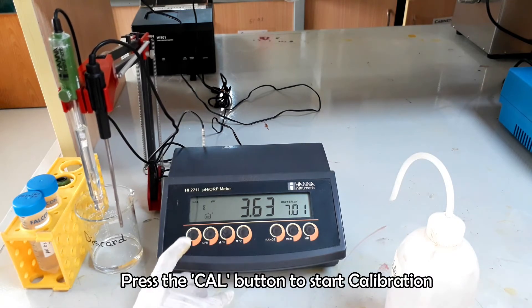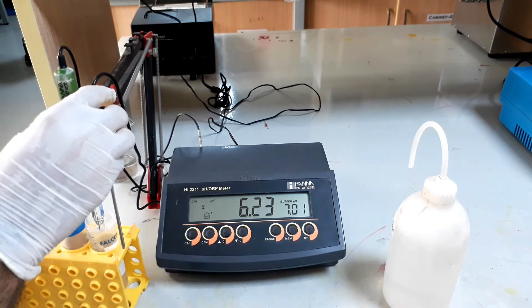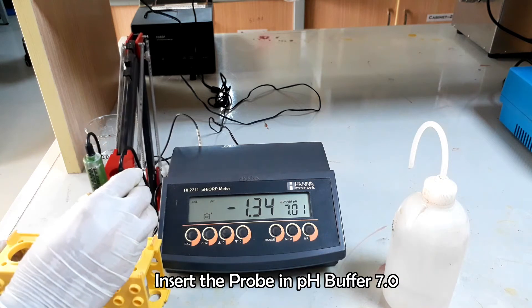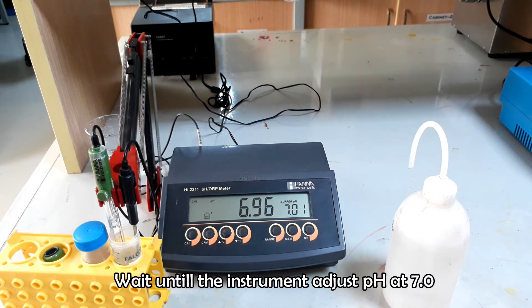Press the cal button and insert the probe along with the temperature meter into the pH buffer 7 first, because the instrument is asking for buffer 7. Wait to adjust the pH at 7.